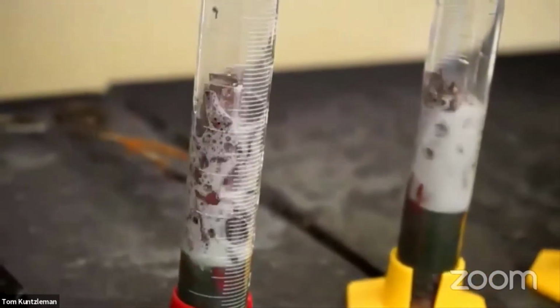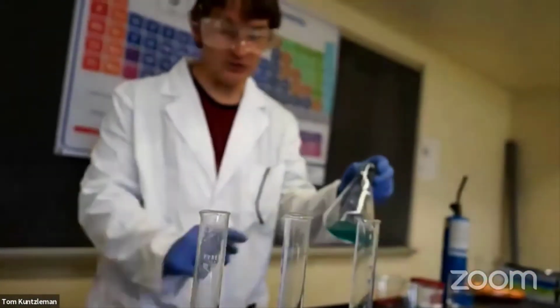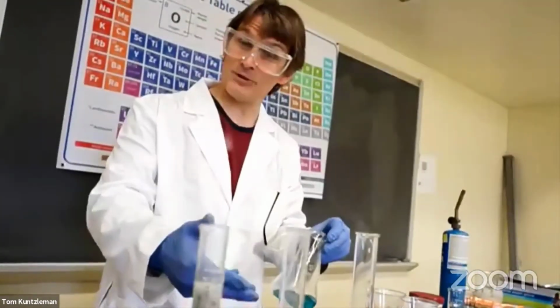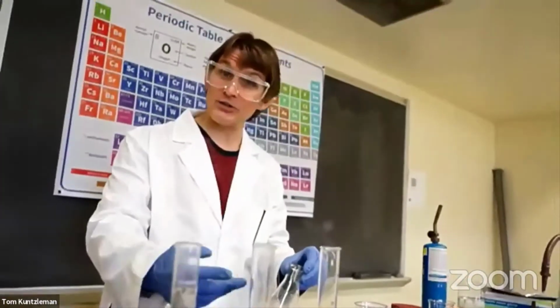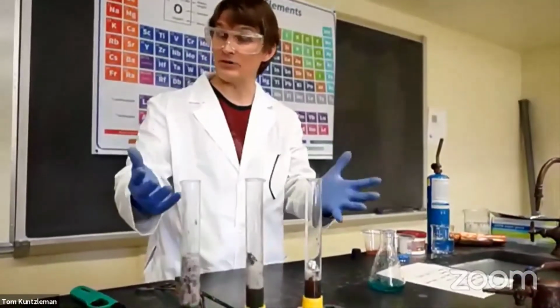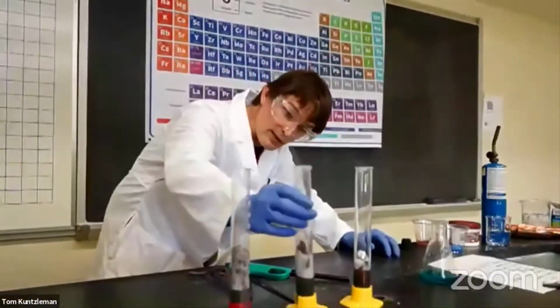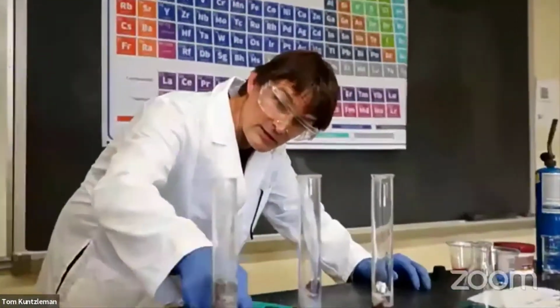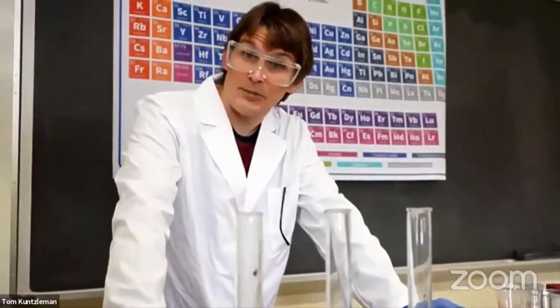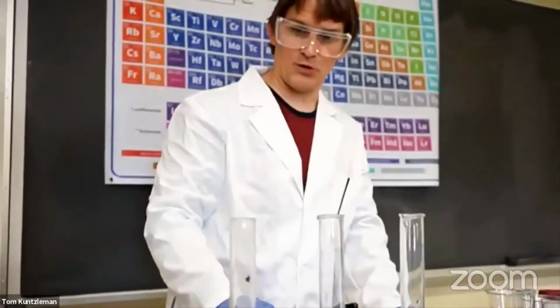And so what's happening here is that the copper metal that's dissolved in the solution, that's blue, it's actually reacting with the aluminum. The aluminum's getting dissolved, and the copper that's in solution, it's actually plating out, we say. It's plating out as copper metal. And so these little tiny pieces of solid that you see forming, those are pieces of solid copper metal coming out.